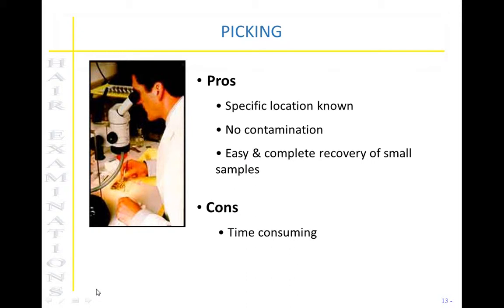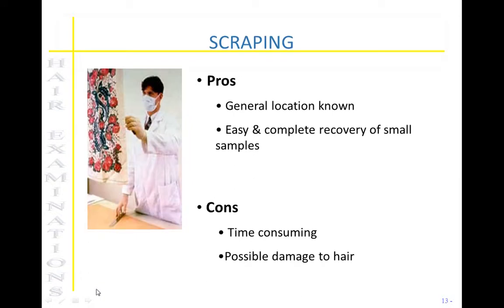Picking hairs with tweezers is very good in most situations because you're going to specifically know where those foreign hairs were collected from. As long as you're cleaning the tweezers in between exhibits, there isn't the concern for contamination. However, in some instances, this can be extremely time-consuming. So in some instances, items may be scraped.